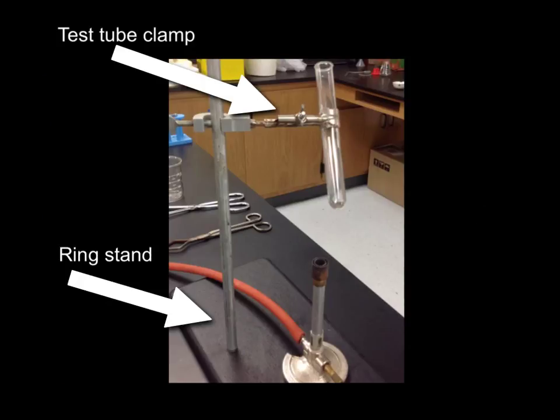Another way that you can use a test tube to be heated is over a Bunsen burner, and you can see that you would clamp your test tube to something called a ring stand, and a ring stand is basically just a support system. You can clamp a bunch of different things to it. I'm going to show you various clamps and what they're used for, but the ring stand is really just the base for holding the clamp so you can suspend things over a Bunsen burner or for different reasons.